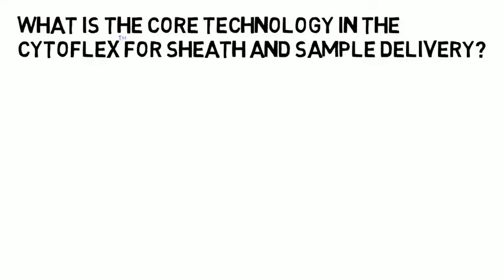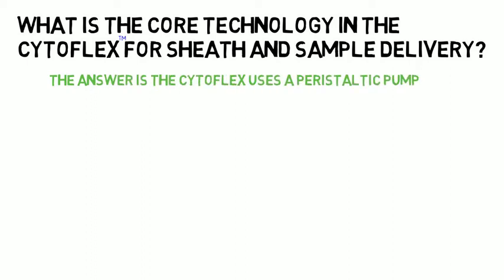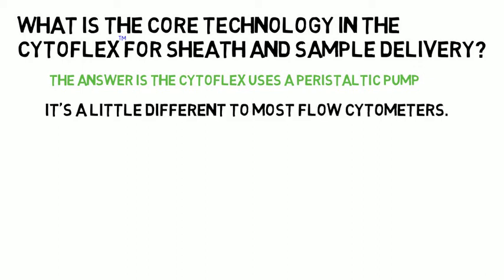So what's the core technology in the CYTOFLEX? The CYTOFLEX uses a peristaltic pump that is quite different to many other cytometers. So it's important for us to look carefully at this technology to see how it works and how it impacts the quality of the data produced.